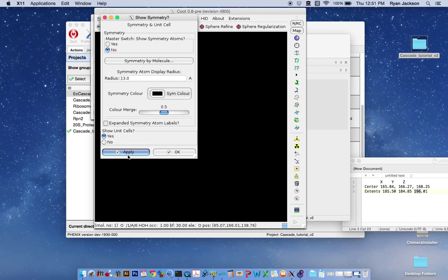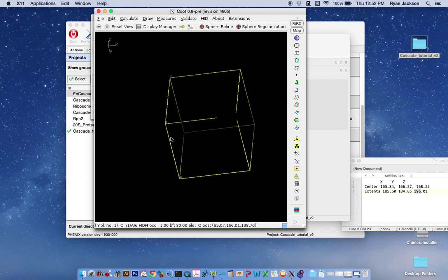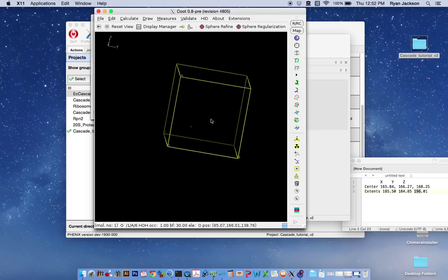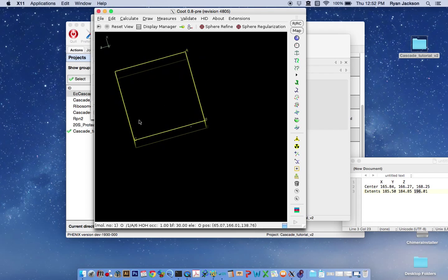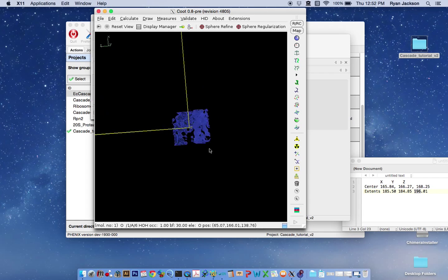This is going to help us find the newly cut out density. So if you look, you can see that it's a very much larger unit cell, and the cutout density tool places the new density at the origin, and so if we move to the origin here, we should see the density as we move close to the origin.